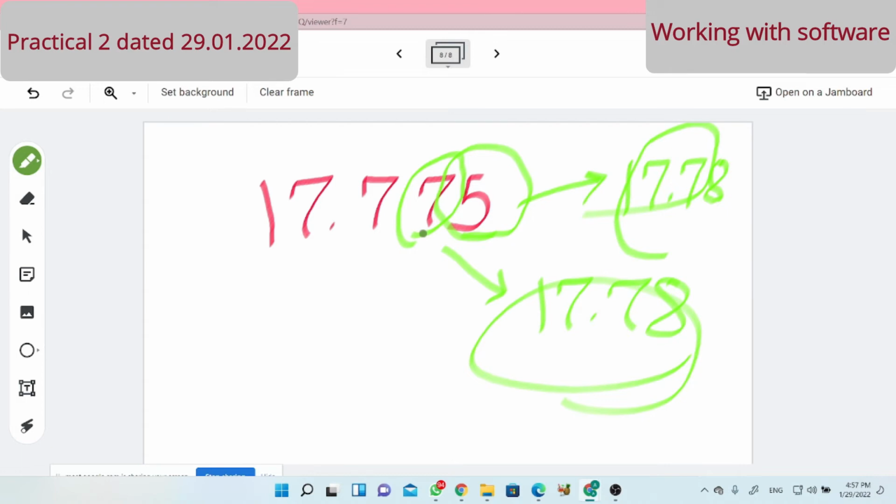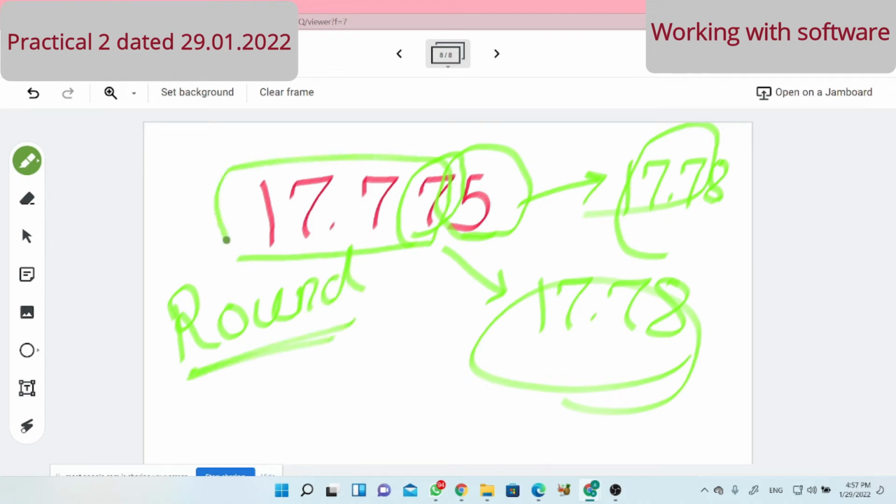Actually, I was expecting a question from you, but whatever I come across and feel it is necessary to inform, I inform. So here I told you about the rules to round the numbers. In this experiment, you are going up to 2 digits, but actually when you work, you will go to only 1 digit after the decimal point. So while writing the initial reading or zero reading, you will write 0.0. Here the initial reading will be 0.00.